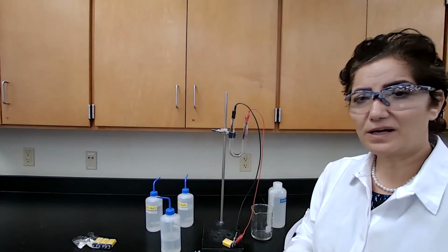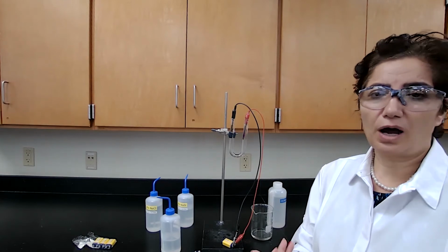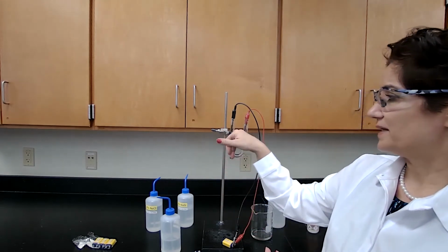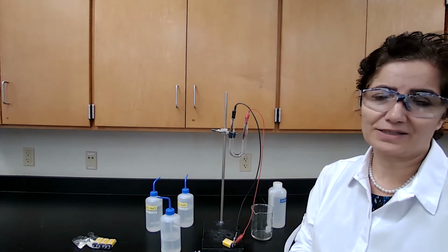And when it does oxidize, it would give I2. I2, or iodine, is yellow to brown in color, and it would turn the anode side yellow. The yellow color would appear on that side.